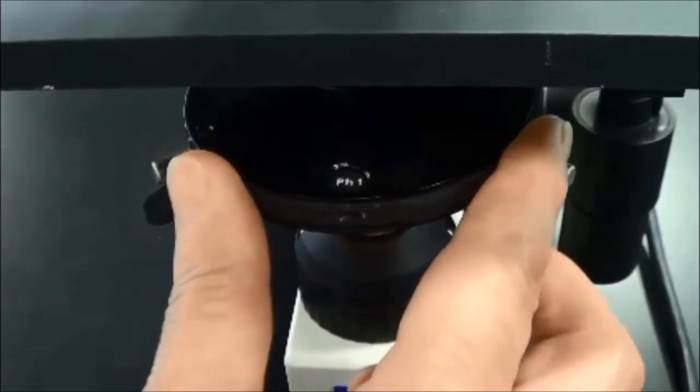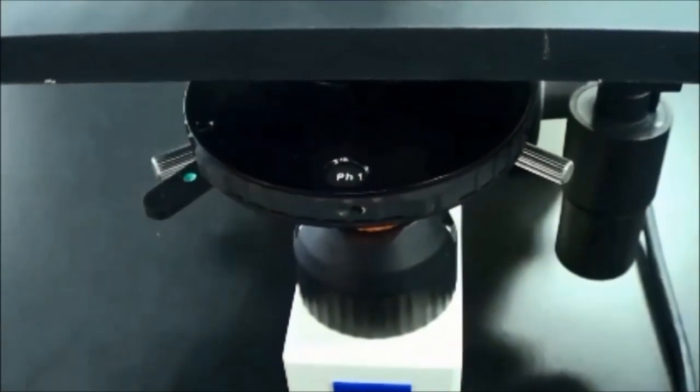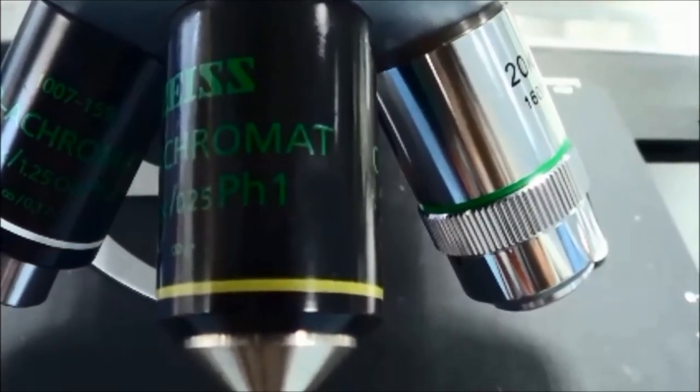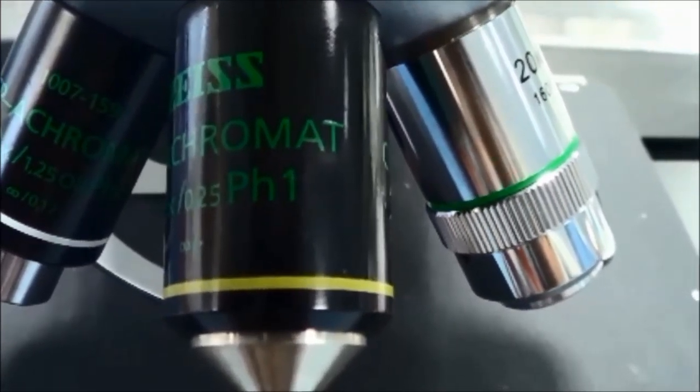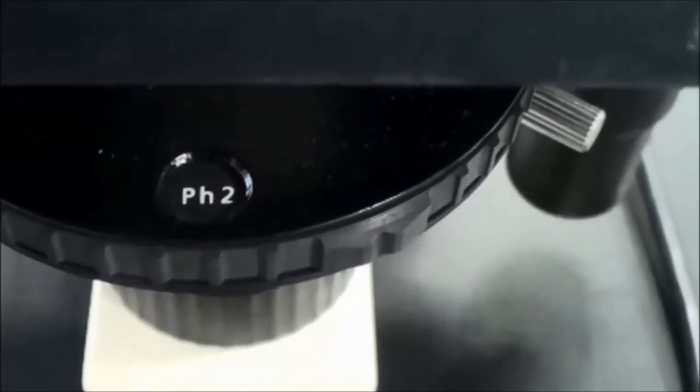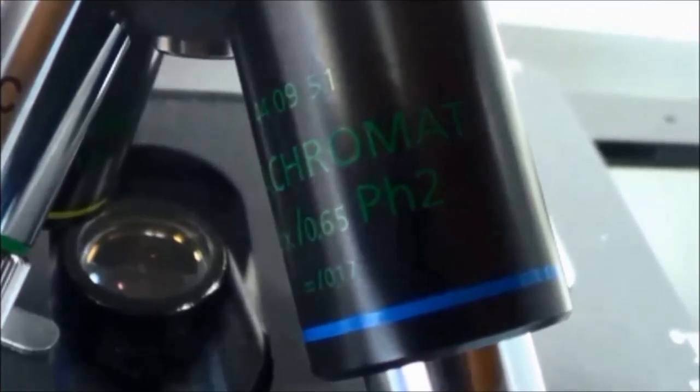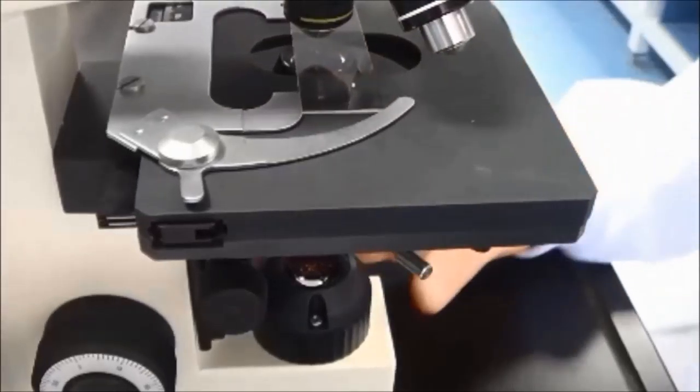Rotate the turret disc until PH1 is clicked into place. Set the relevant position on the turret disc of the condenser to match the phase contrast objective being used. For example, PH1 matches with the 10x objective. PH2 matches with the 40x and 100x objectives.